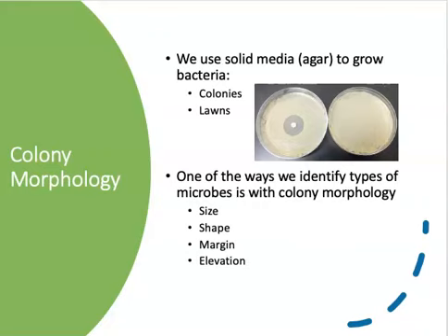The last thing we're going to be talking about today is a little more detail about colony morphology. Remember, a lot of what we do in the microbiology lab is identify microbes. We try to find out what the genus and species of the microbe is so we can report back. In our evaluation of these bacteria, we're gathering bits and pieces of information about them with different tests that we run, including growing them in different types of culture media.